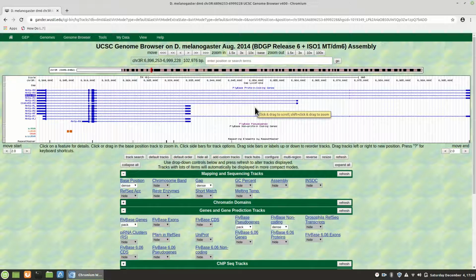So which direction are we going? Are we on the strand going 5' to 3' left to right, or are we 5' to 3' going right to left? Which is also the complement. You'll have to know which one you're in. It'll tell you what to do.